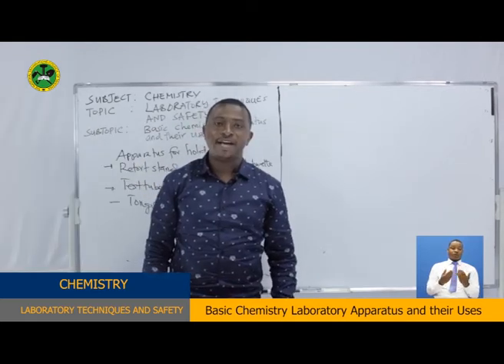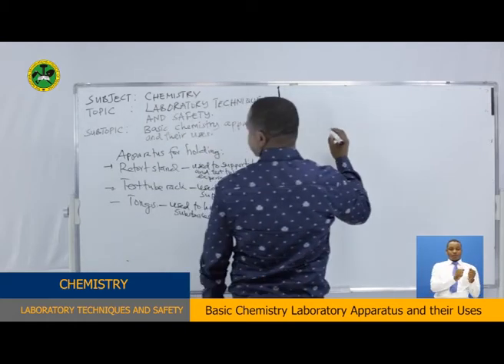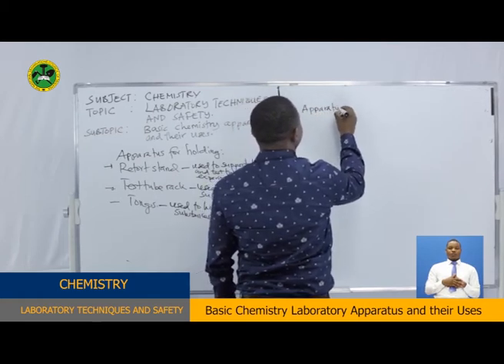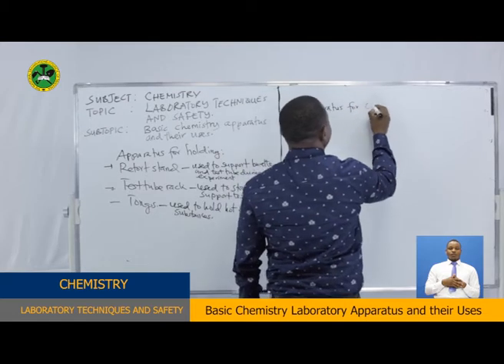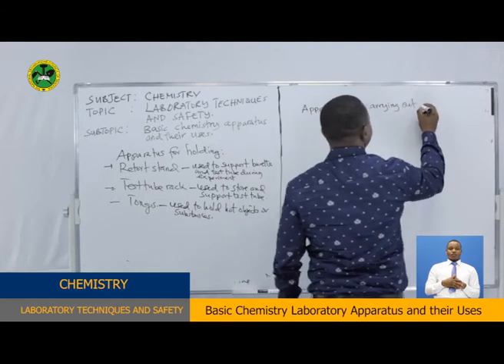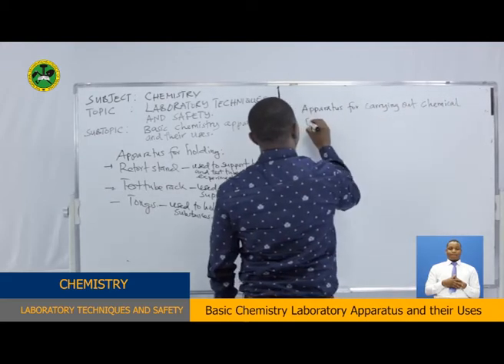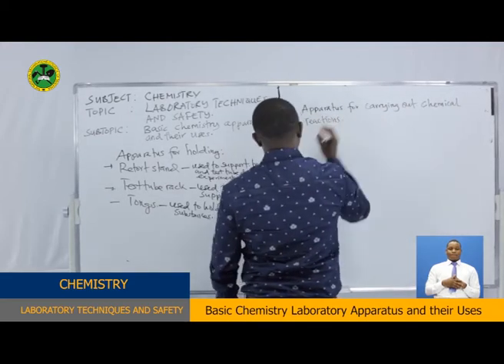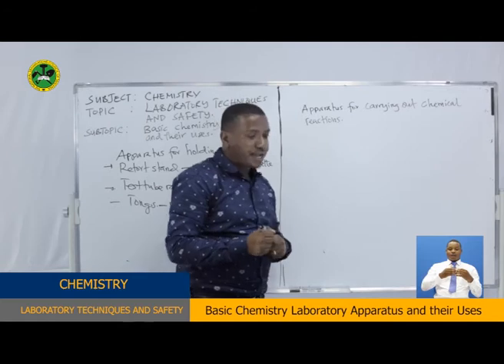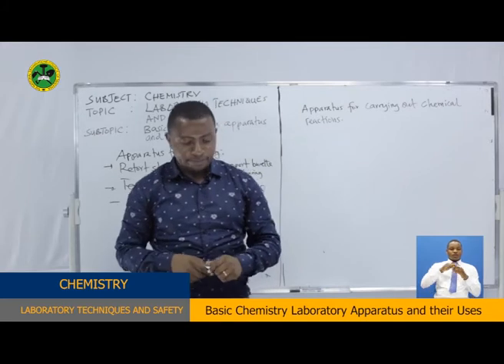Dear students, let us now see the apparatuses for carrying out different chemical reactions. Apparatuses used for carrying out chemical reactions. There are several apparatuses used for carrying out chemical reactions. I will pass through them.